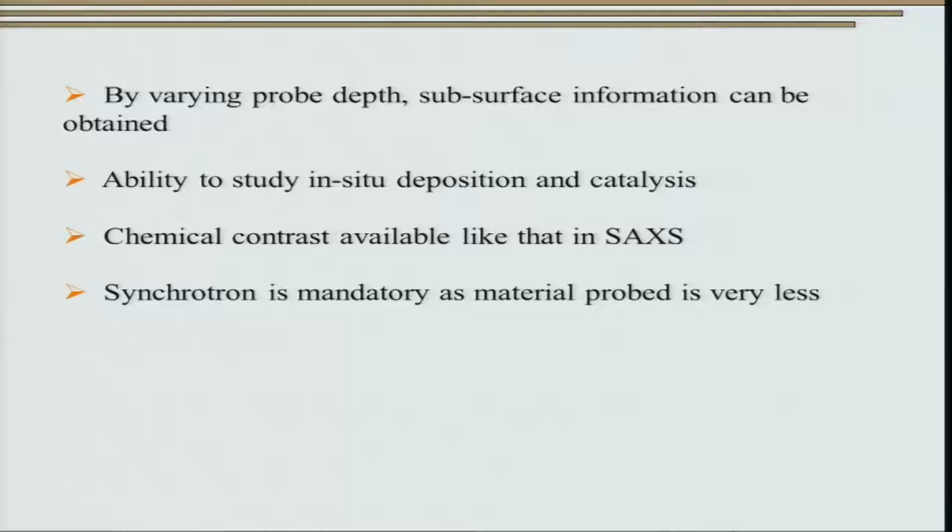peculiar to GISAXS is the ability to study in situ deposition and catalysis. At the same time, like we had discussed in the last class, small angle X-ray scattering also provides us, if not directly, in an indirect way, the chemical contrast between different phases. We can also use GISAXS and separate out chemically distinct entities.